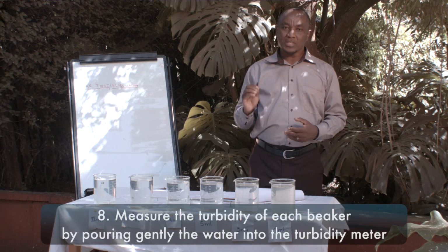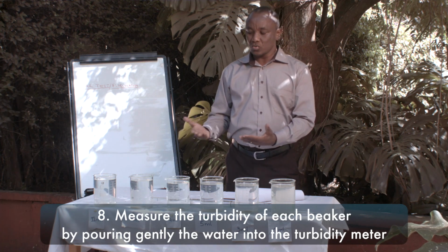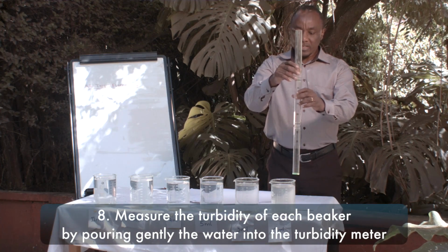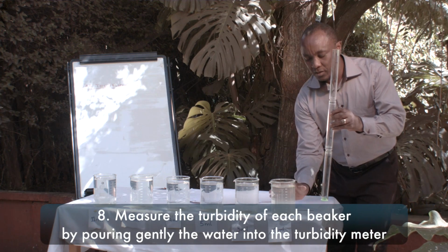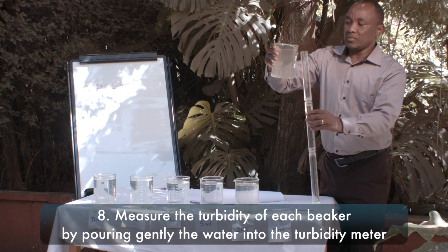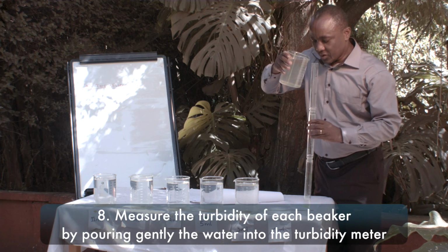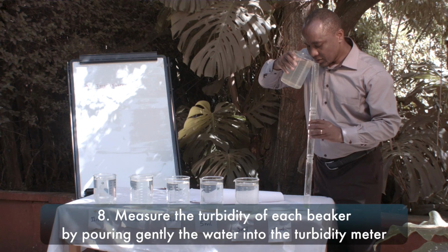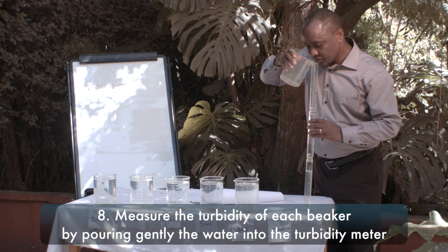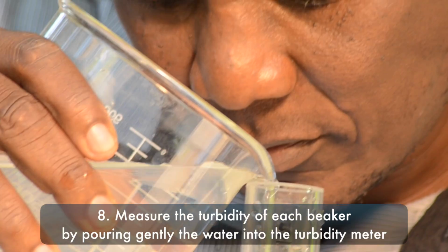We have now waited for 60 minutes. The next step will be to determine the turbidity of each solution of all the 6 beakers. The procedure is as follows. We use the turbidity meter, hold gently the beaker for the first dose and then pour the water as you watch the cross down there to determine which level of the water the cross disappears.